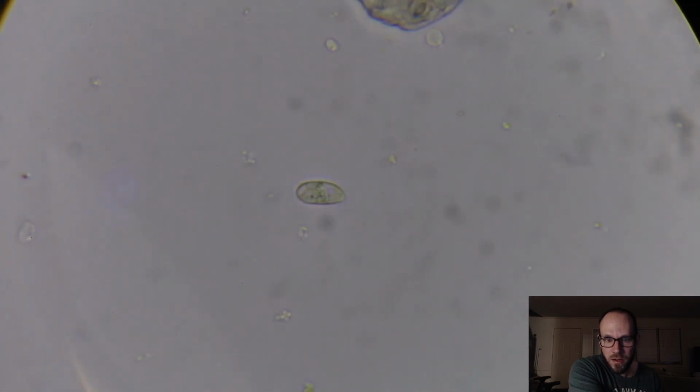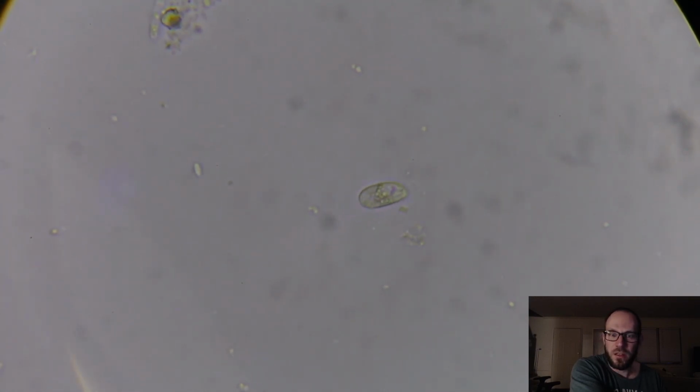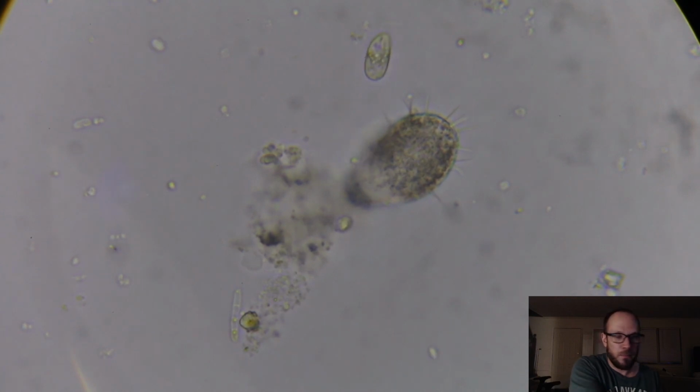Oh, this guy doesn't seem to be doing too well. He's moving kind of slow. What's going on with you, Gramps? You seem a little languid there. You can see his little... Oh, it's a flagellate. You can see his little flagella right in front of him. And that's why he's moving so slow, because he's a piece of shit. Not flagella. Yeah, flagellate. That's what he is. I've seen a lot of these slow-moving flagellates, actually. They're all very... Whoa! They're all very small. What's that? What's that gotta be? Yeah, you go under it.